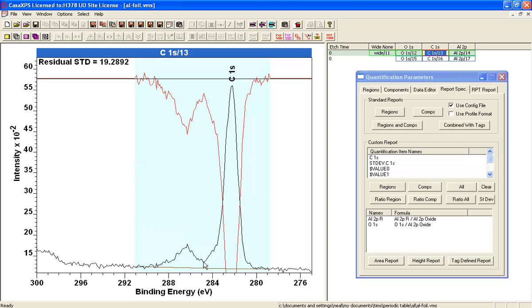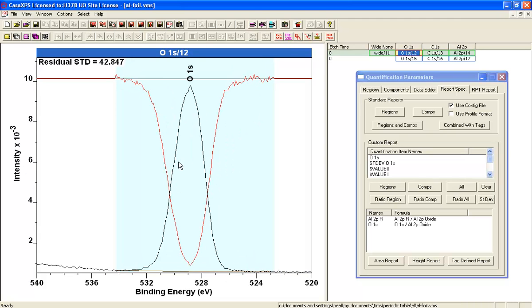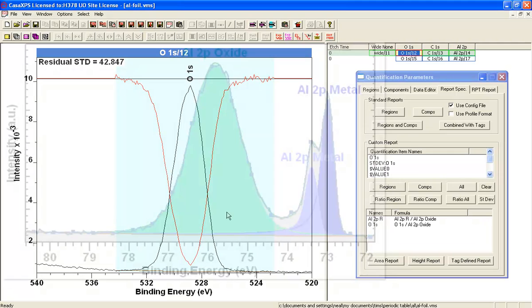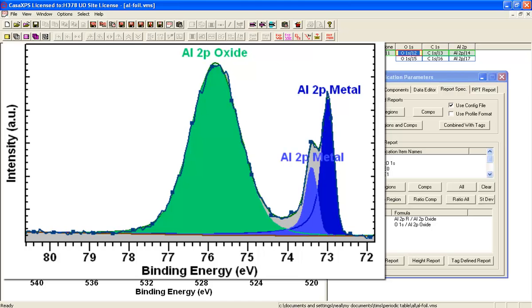So actually the oxygen peak itself is not a simple peak. This must have other components in there, hence the ratio was not quite what you'd expect. So by doing peak fits, you can refine your understanding of the data.